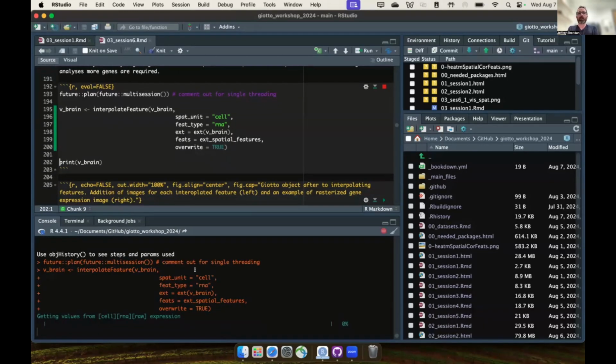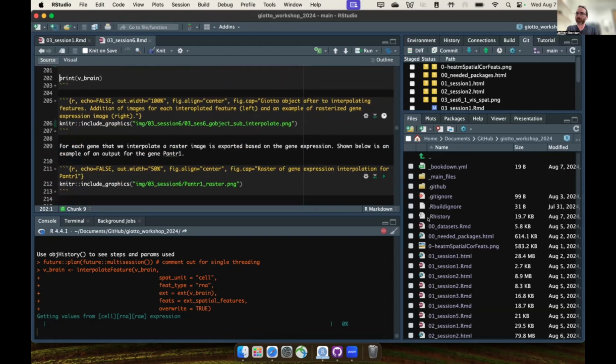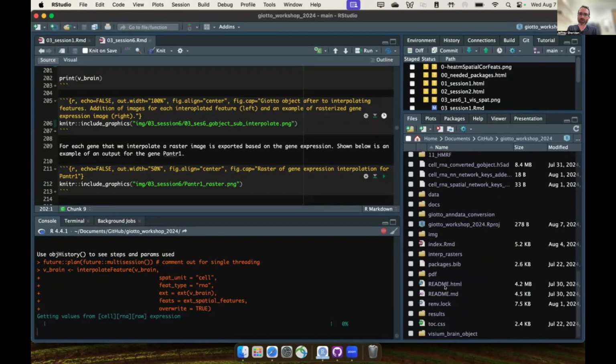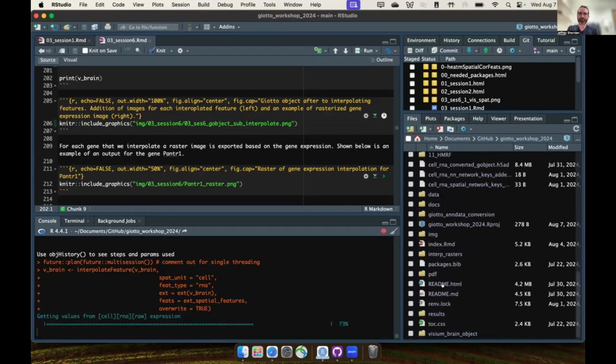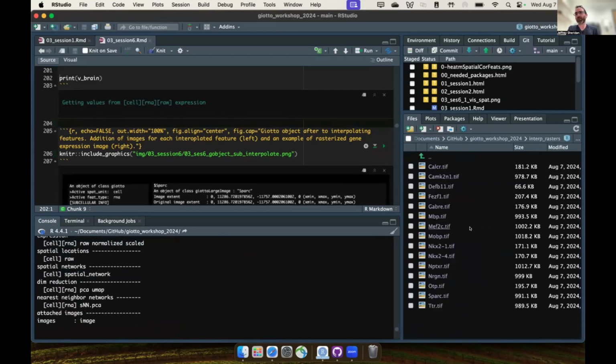This will take a little while to show any progress. If you're running on a single core, it should update basically automatically. But when running multi-core, it will take a little while and then it should just kind of zoom right through. Whilst we wait, I can show you what the output of this is. Oh no, we cannot. But what we are looking for is what we're outputting. Now we can see it's updating the bar, and we've outputted a total of 15 images.